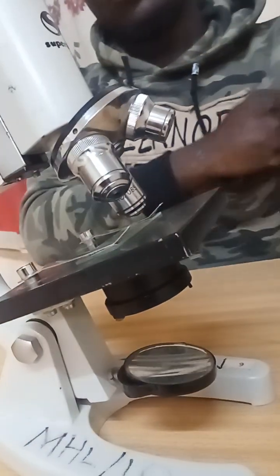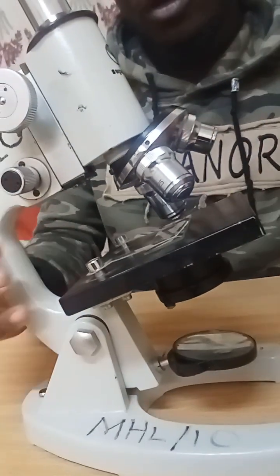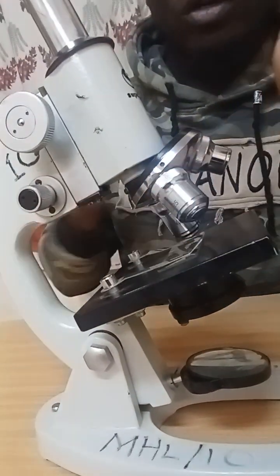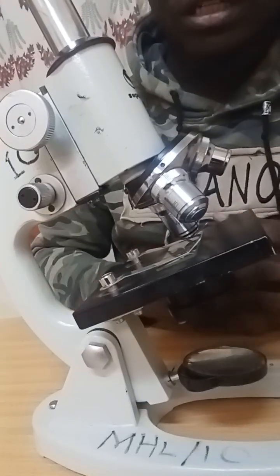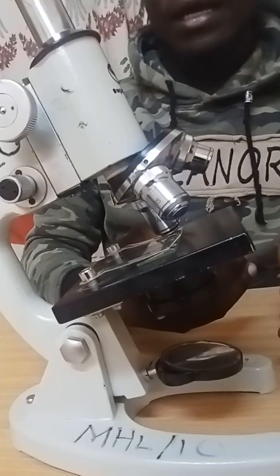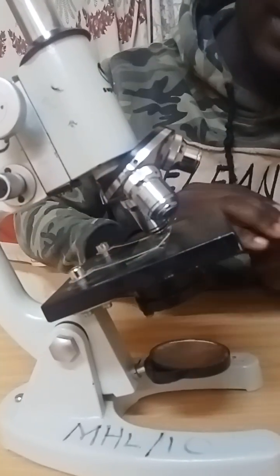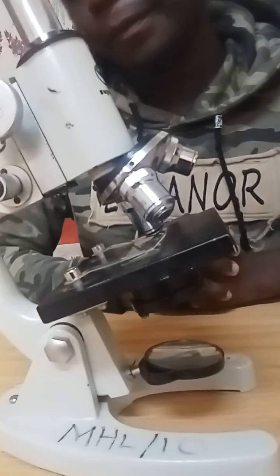And maybe to look at the safety measures when handling a microscope, you do not wet the stage. It can bring about rusting and refraction of light. Then you use tissues to wipe the lenses and the mirror.